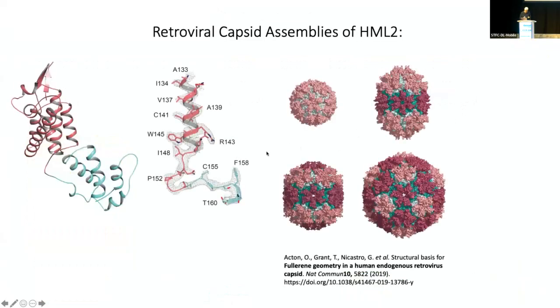What's interesting here is that this is a large macromolecular assembly with a lot of signal. It comes from this protomer assembling into the different symmetries, and you can see within the context of these assemblies, we can actually resolve even the flexible linker regions quite nicely, which I've shown here. So here we have a T=1 and then various other higher symmetry examples. So this is a heterogeneous data set.